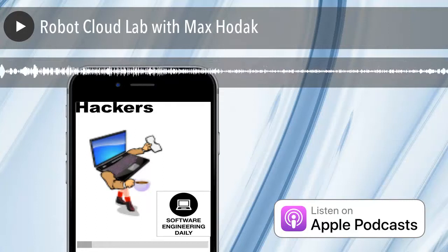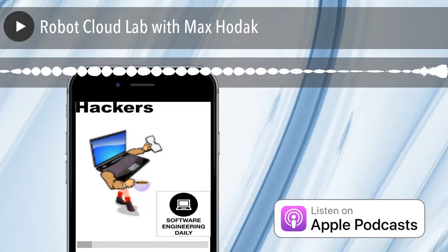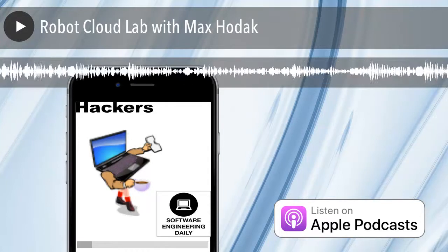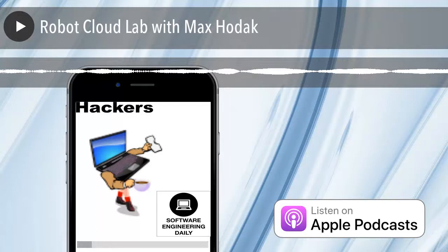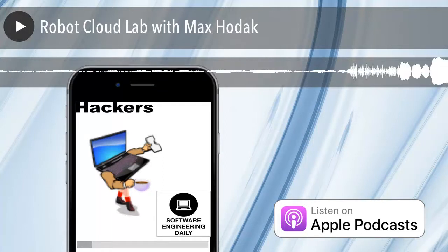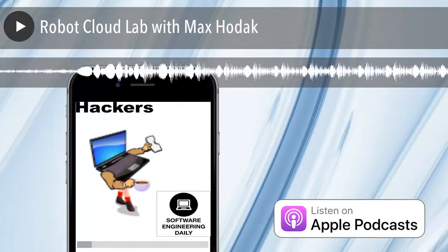to build a centrifuge. Now, this suite of archaic machines that you're dealing with, are these machines getting better? Are there companies out there that are working on next generation PCR machines with better APIs and stuff like that? Or do you kind of feel like you're alone in wanting to revamp things?